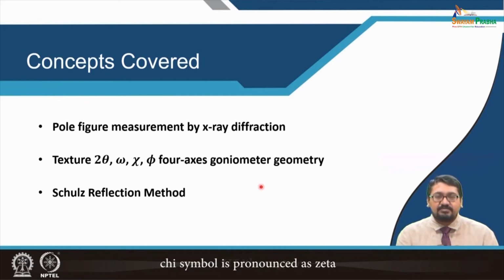So, diffraction methods are used to find out various kinds of things. For example, various crystals can be diffracted, polycrystals or single crystals, where you can get the relationship between theta and the HKL planes based upon Bragg's law.